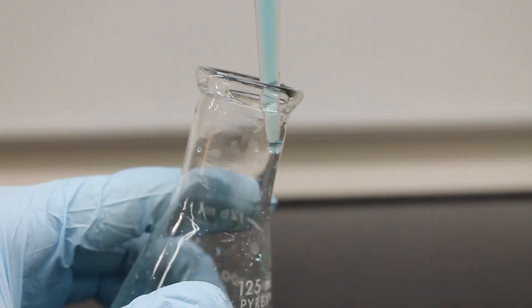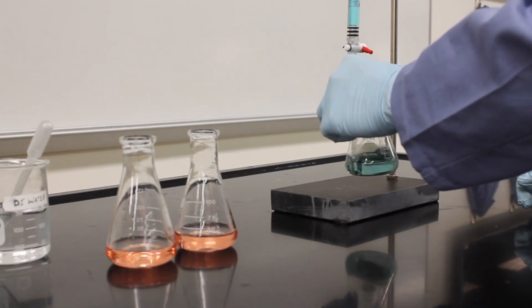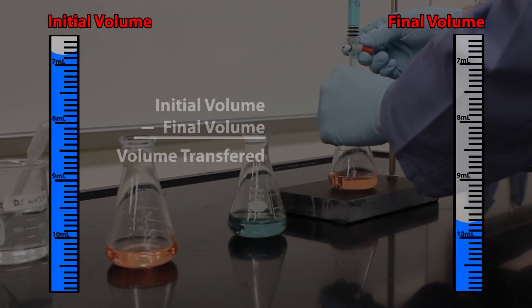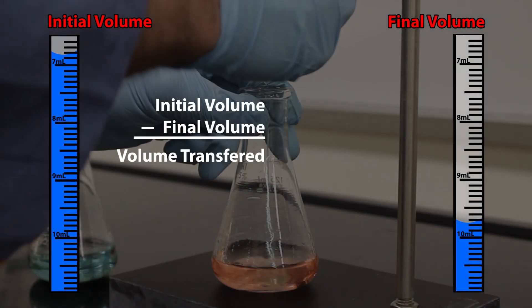Once you have your desired volume make sure to touch the tip of the burette to the side of the transfer container to transfer the last bit of liquid. If you didn't start at zero make sure you take your final volume minus your initial volume for the amount transferred.